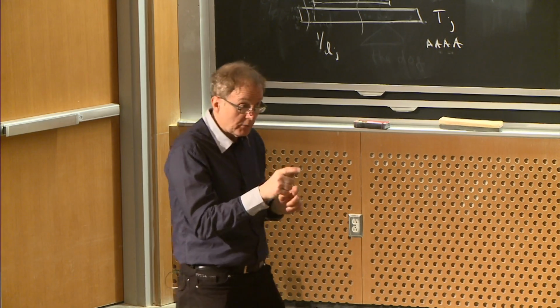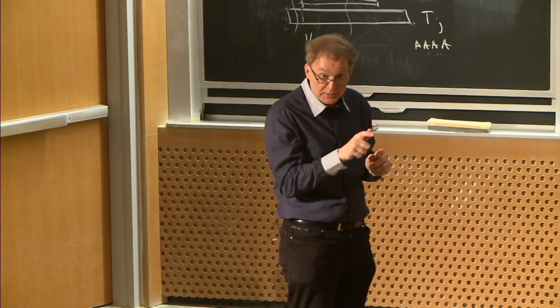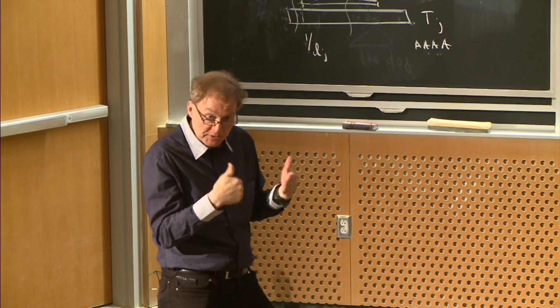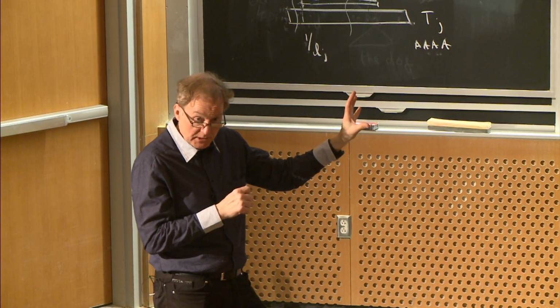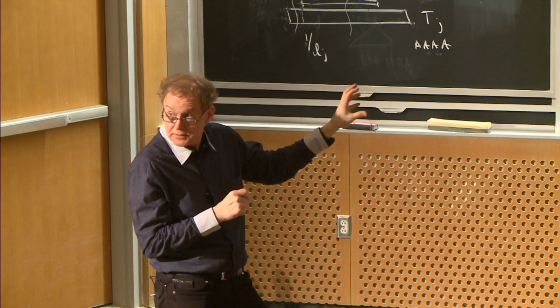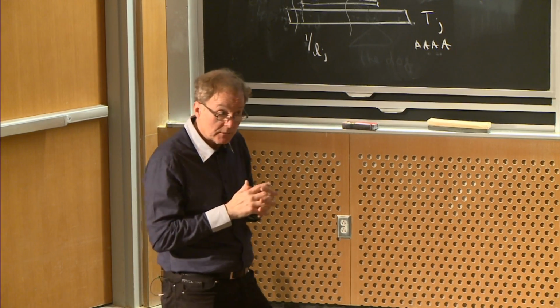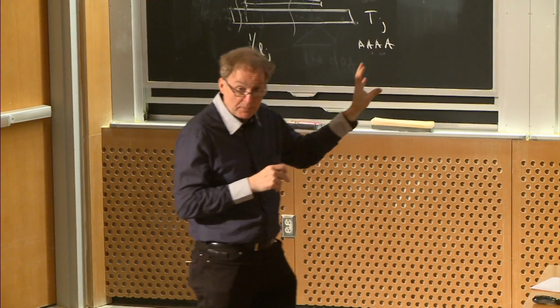And you'll be able to count the number of exon-exon junctions you have of different types. And that will give you an estimate of how much splicing is going on and will help validate the kinds of conclusions that come out of programs like Cufflinks or MISO, which is another program from the Burge laboratory that is used to estimate isoform prevalence.